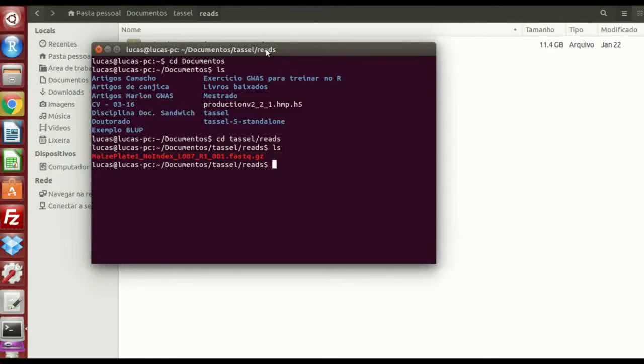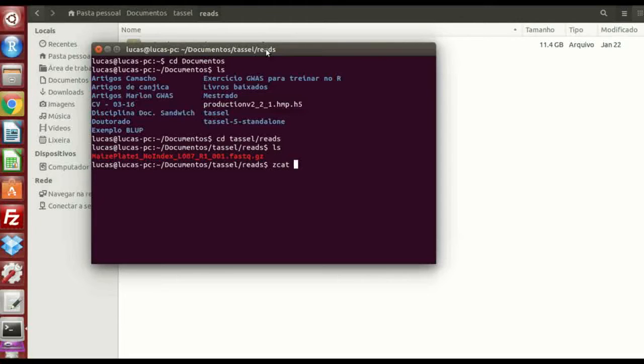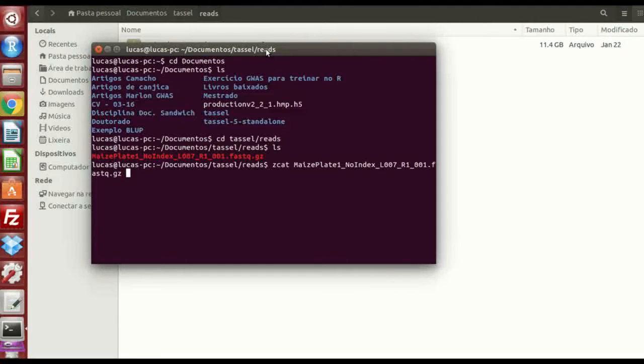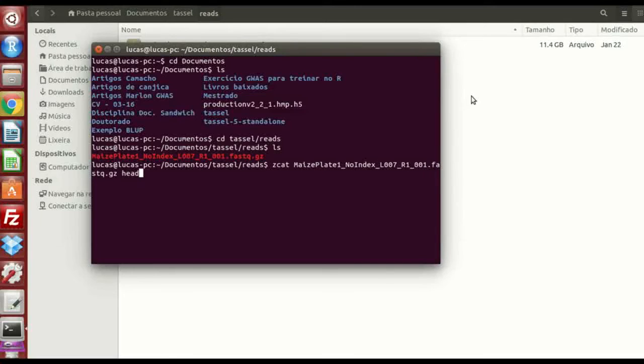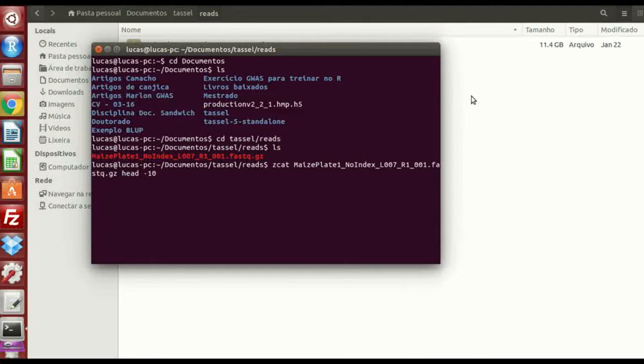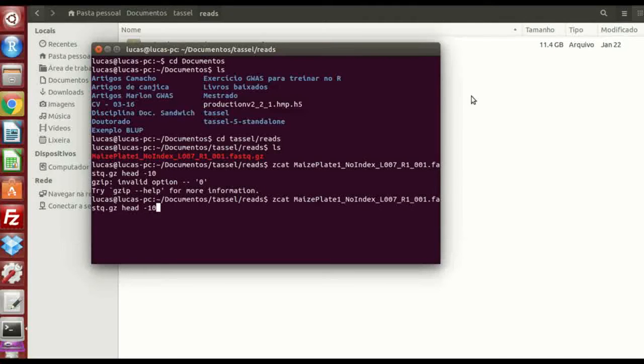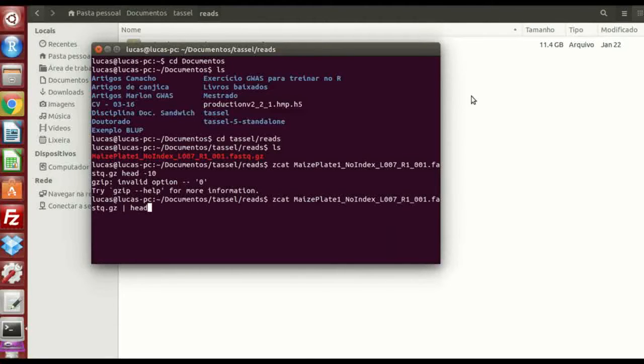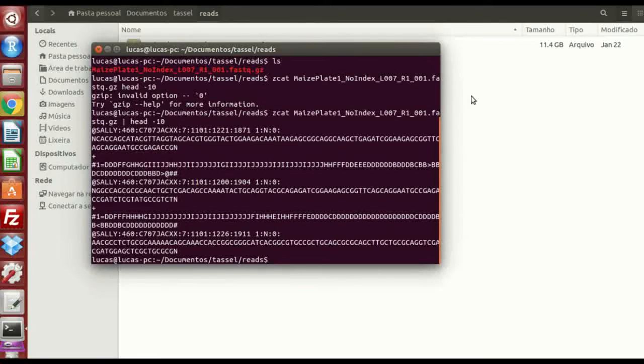And inside the reads I have this, which is my FASTQ file, and I'm gonna put a command called zcat, the maize plate, and just put head here, 15, or 10. I don't know what happened, just a second, okay, I have to put this first. Yeah, perfect.